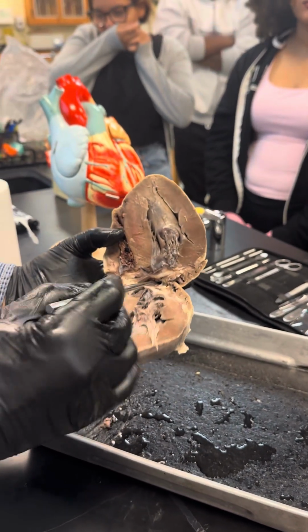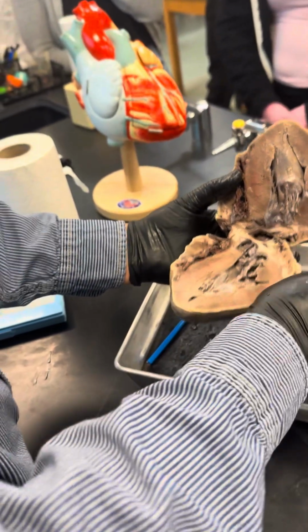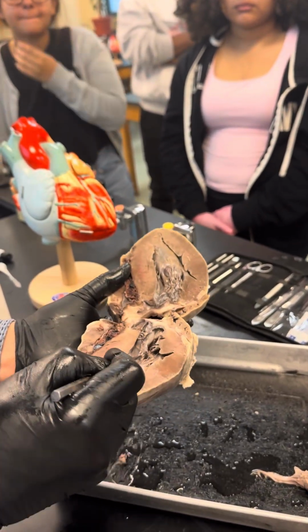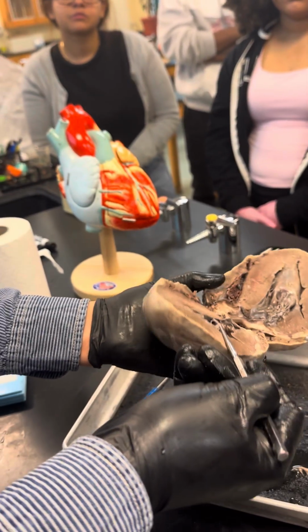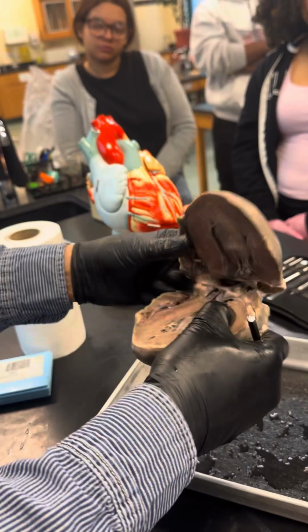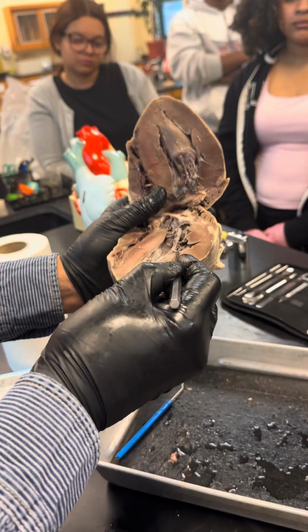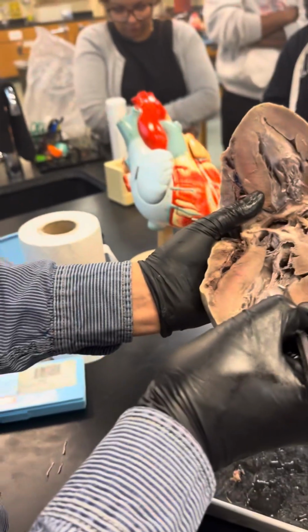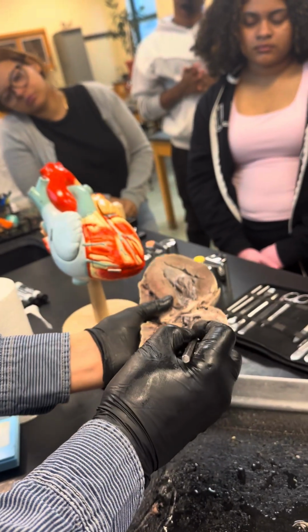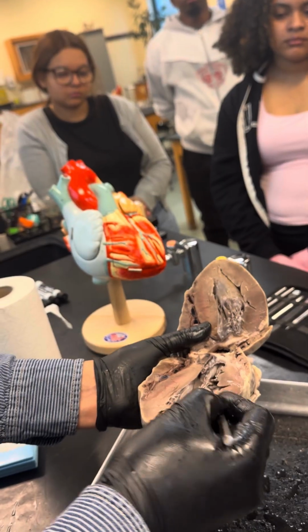Okay, and this one is the right ventricle, left ventricle. Remove this, and this thread-like structure, what is it called? Chordae tendineae. See this one? You can hold the heart; you don't break it down. Chordae tendineae. See, it's very strong. They are connected with the papillary muscle at the bottom. These are the papillary muscles. This chordae tendineae, what does it do? Close and open the valve.